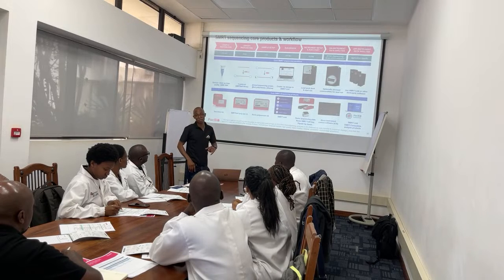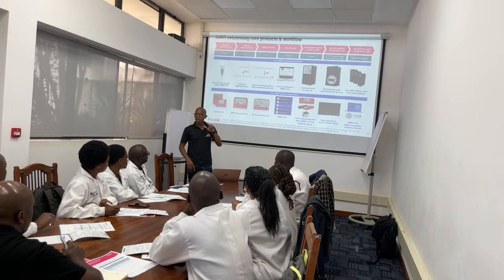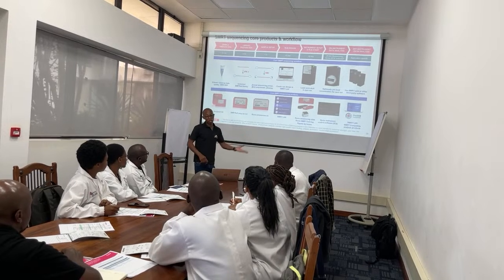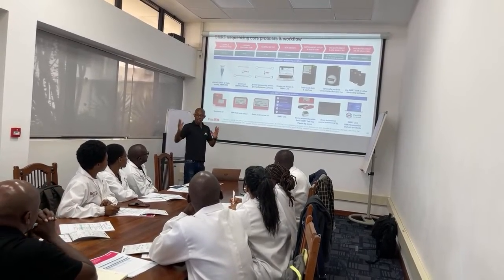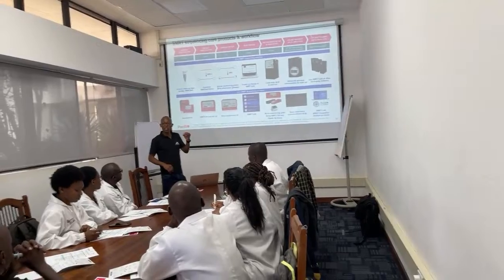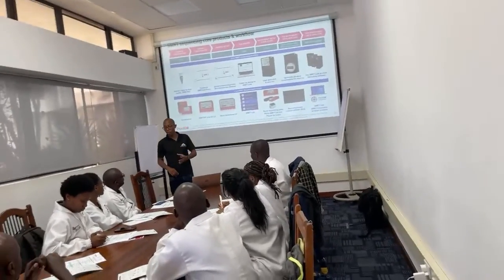There's a lot of QC steps, that's one thing I can tell you. As much as there are a lot of QC steps, that gives you an opportunity to control what you're doing. That's why we are so careful with everything that goes into the Megaruptor. We do QC to check that we actually got the right fragments, and how much we recover from the shearing, because we need to start with a certain amount of DNA into the library.